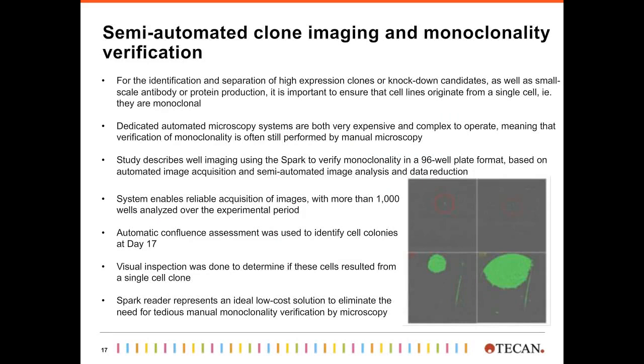The last application on imaging is very quickly explained. We wanted to test the potential of the reader for semi-automated monoclonality verification. What we found basically is that yes, it works.